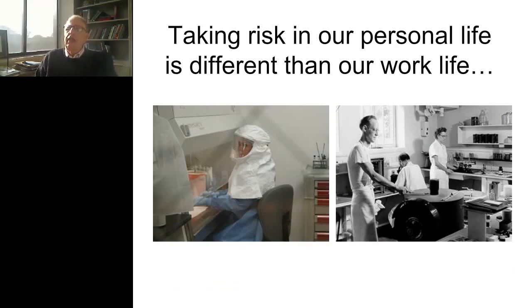Going on to the next slide, look at the changes in laboratory safety during the last 50 to 60 years. The picture on the right is from the archives of the State Hygienic Laboratory here in Coralville, Iowa, around 1950. As you can see, they're working in the laboratory without any sleeve protection. It was very common at that time to eat and drink in the laboratory.